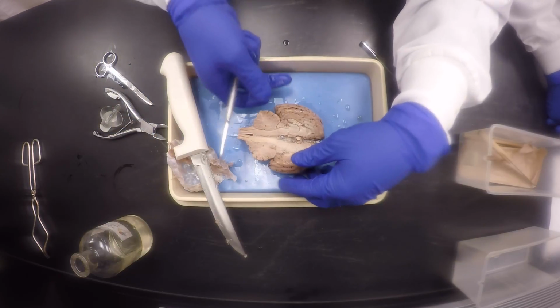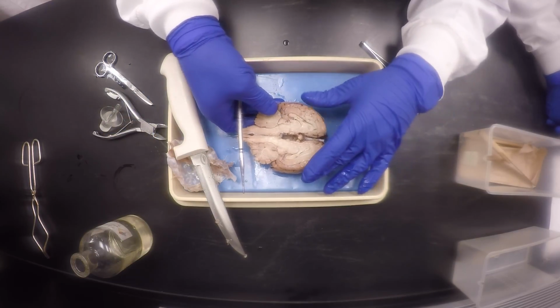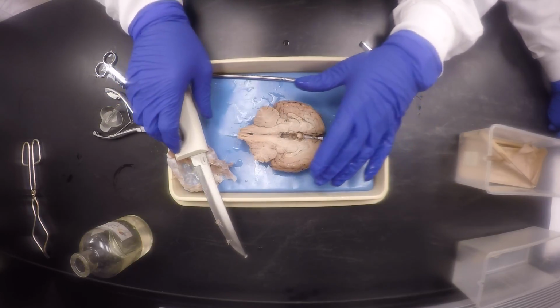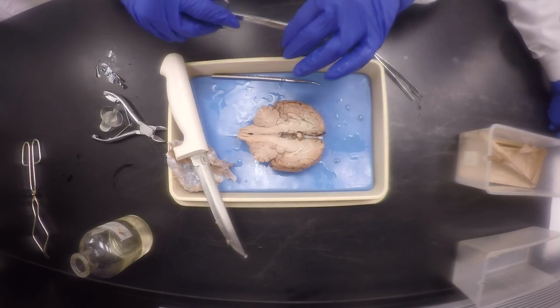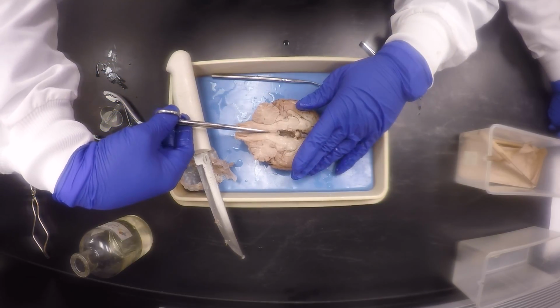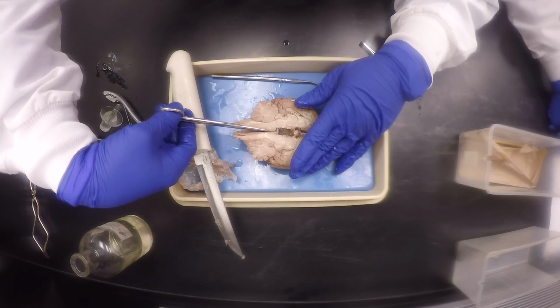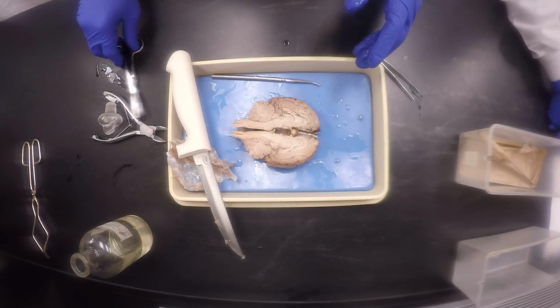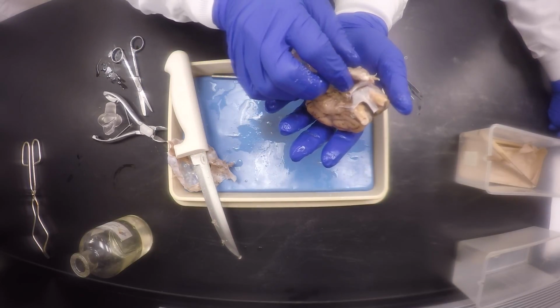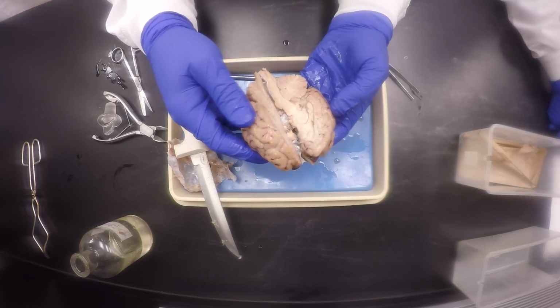Okay, so now what I'm gonna have to do, eventually I'll cut the whole thing off like that. And then I could sort of use my scissors. Remember, we left part of the dura mater down there, so we can finish it off like that. I'm being gentle with mine because I don't want this thing to fall off.